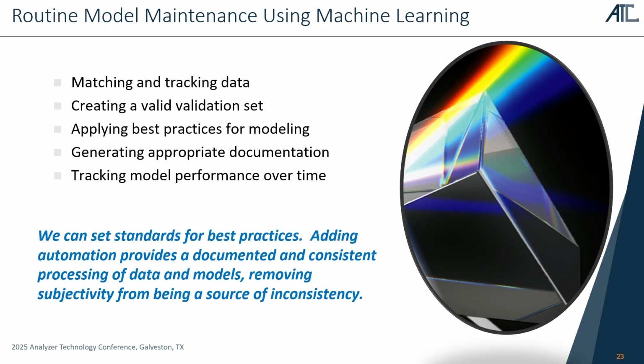So this is where chemometrics kind of blends into machine learning. So I mentioned before that one of the issues is really human error. Because what happens now in processes, when I started teaching the chemometrics process to people, we've taught thousands of people.